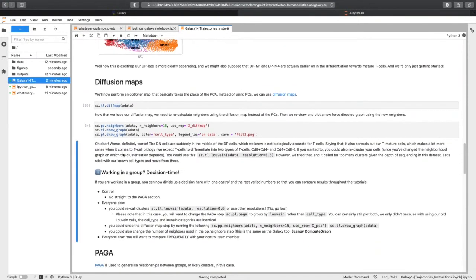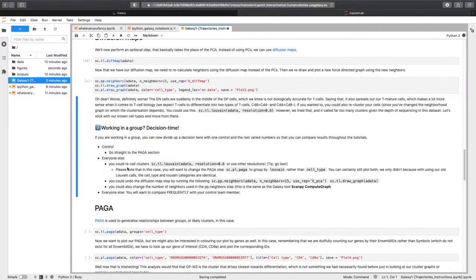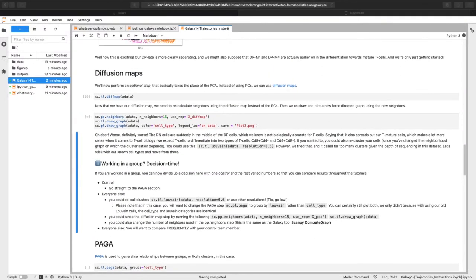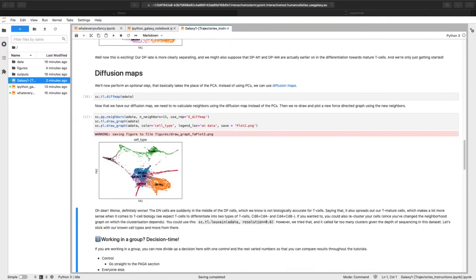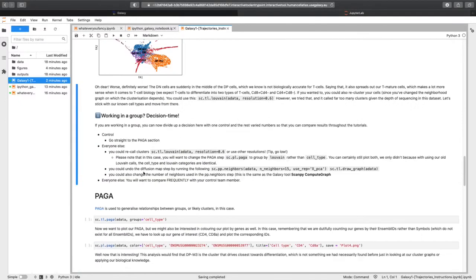Calculate diffusion map. Do all the rest of the calculation. See what happens. And we're there. Yeah, it's not great, is it?